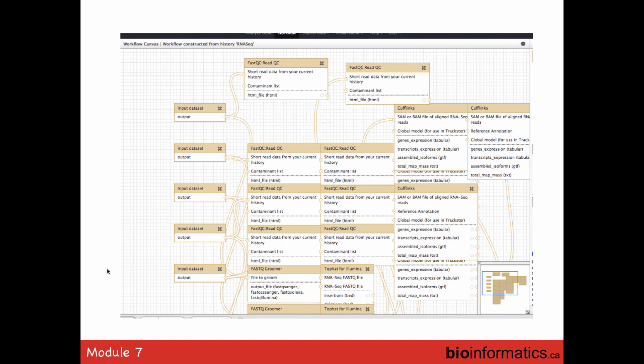Galaxy also has a workflow graphical user interface where you can edit workflows. The curves linking boxes together represent datasets flowing between steps. All of these come out when you extract the workflow, and you can then edit it — change file names and parameters. It's quite flexible from that point of view.